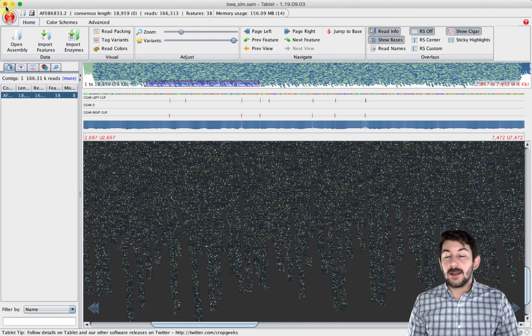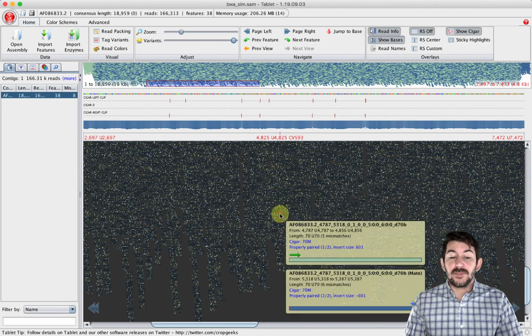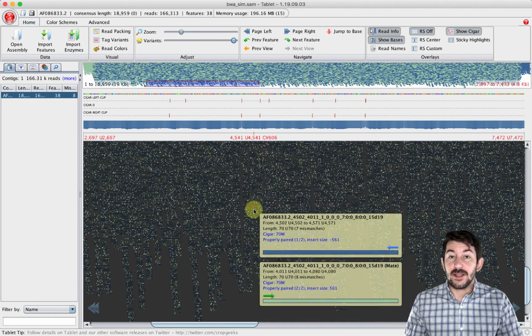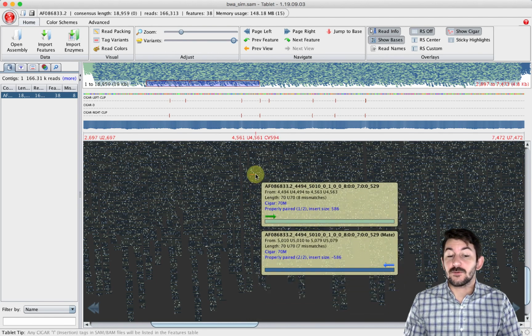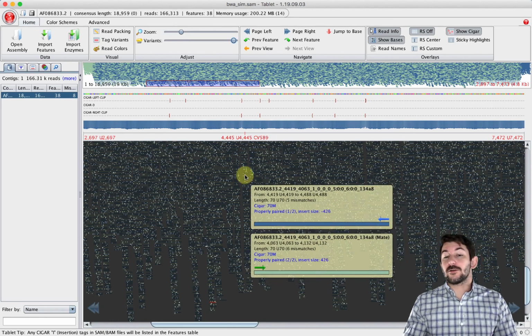So that was the lab for today. We're actually going to be doing a lot more with read mapping in the next lab. We're going to be looking at how to actually call regions where there's a consistent variant in the individual that you sequenced relative to the reference. In other words, where has there been actual polymorphism and all sorts of fun stuff.